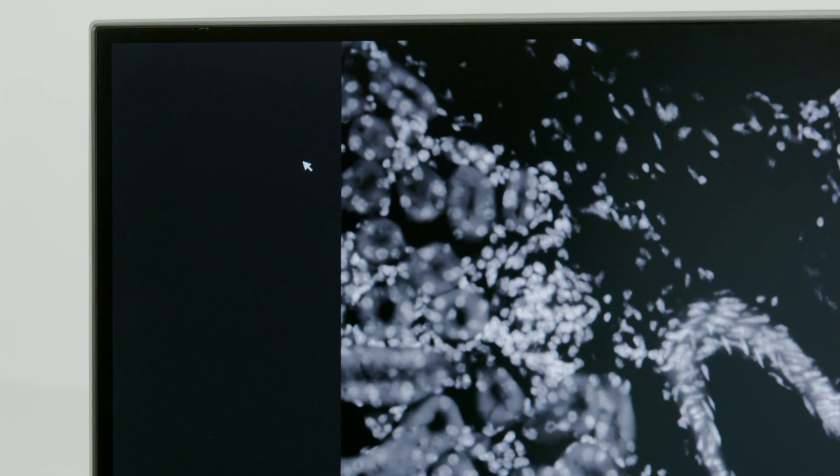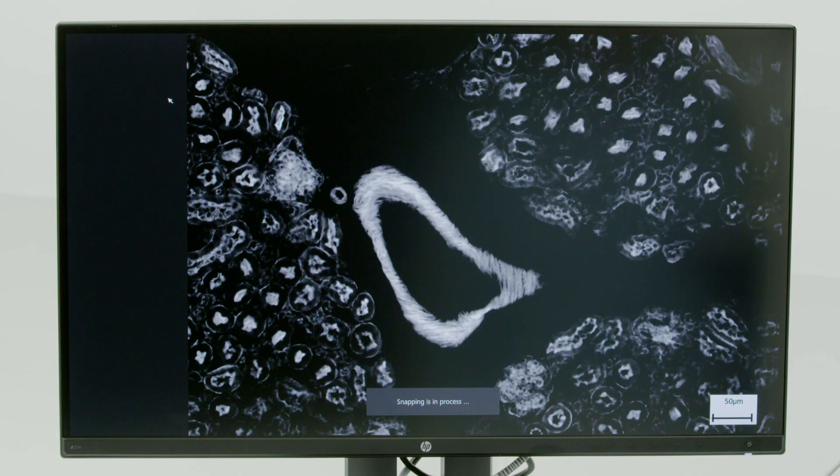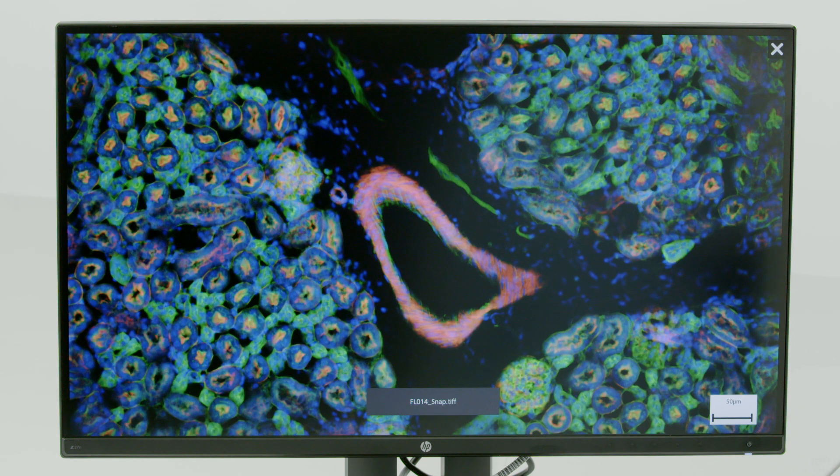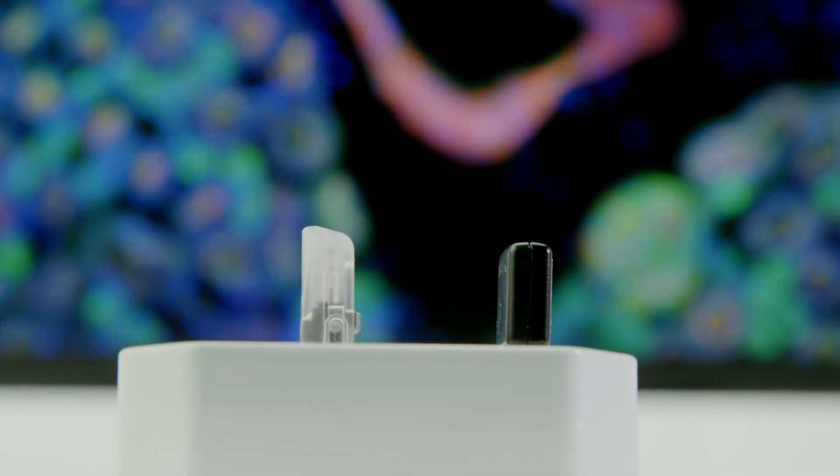Press SNAP. Your system takes over. And there you have it. Your overlaid multi-channel fluorescent image, including scale bar, is now ready and waiting on your USB stick.